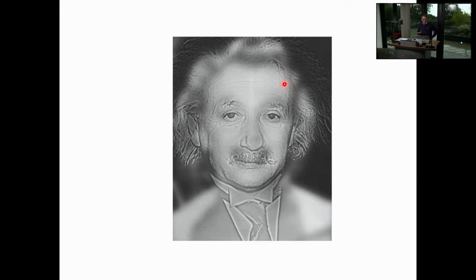And the question is, why is that happening? In fact, this image here consists of two images. Marilyn Monroe's face and Albert Einstein's face are superimposed on this image. And when you degrade the image, the high spatial frequency content, here, around where the hair is, where the mustache is, disappears. You cannot see the high frequency detail anymore, and then you get what is below, Marilyn Monroe. It's much smoother skin. Obviously, she doesn't have a mustache, and so this face then turns into the underlying Marilyn Monroe picture.